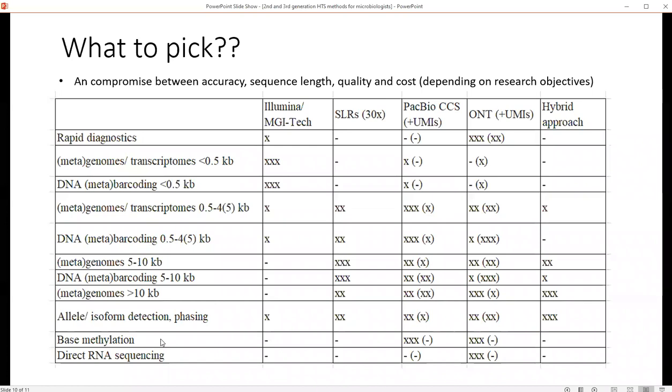To sequence epigenome, principally the only methods that do it in a straightforward manner are PacBio and Oxford Nanopore. Here, this UMI-based approach is not applicable because methylations become lost during PCR. Which of them is better? I don't know. Some say that Oxford Nanopore is more sensitive when recovering various methylations, but PacBio might be more accurate because the methylations again can be recognized in several consensus reads, and so there can be some kind of statistics behind.